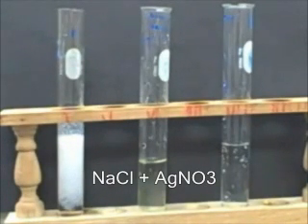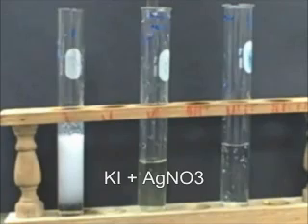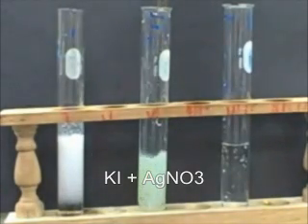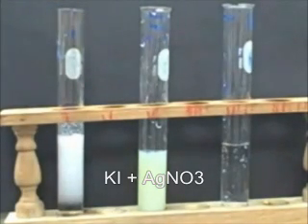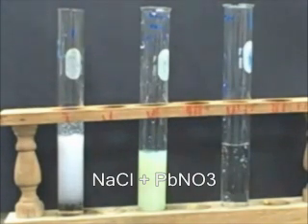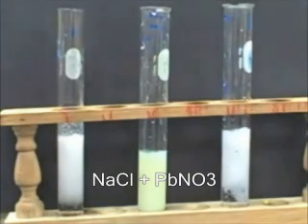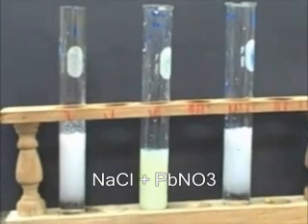So we just added silver nitrate to the first one, and we got silver chloride forming. To our second sample, the potassium iodide, we added silver, and we saw that there's a precipitate as well. So we're seeing that silver iodide forms a precipitate. To our last solution of sodium chloride, we're going to be adding lead nitrate, because that's also one of the exceptions to the halogens: lead in combination with halogens will form a precipitate. So that was lead chloride.